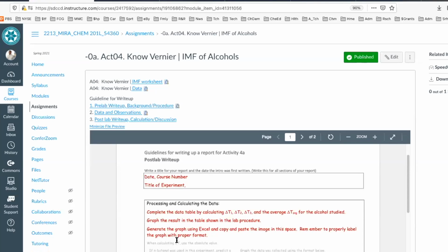You just go in and you are working alone. You are doing the experiment, you're writing your observations in your notebook, or typing it in the computer under lab archives, or just recording it, but not on scratch pieces of paper, okay, some sort of document. And then you're writing the data, you're compiling the data. Once the experiment's over, you're cleaning up, okay, making sure everything's back to its original condition, and you're done, okay? You're done with the experiment. You can leave, basically. What you should do, however, before you leave is turn in the data that you've collected.